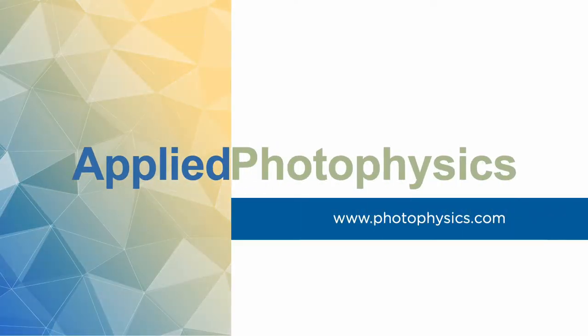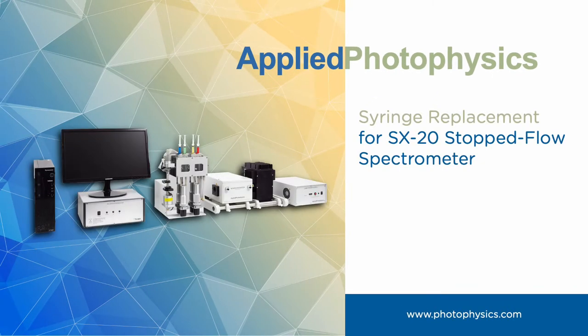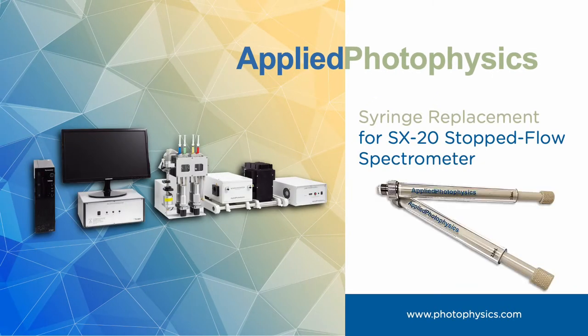Hello, this is Pavel Ryzhov. I'm an application scientist with Applied Photophysics. In this short video I will demonstrate how to replace drive syringes for SX-20 stop-flow spectrometer.